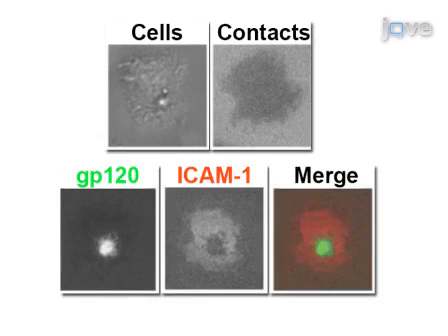This experimental approach can indicate whether cellular proteins like the lymphocyte-specific protein kinase LCK are recruited to the HIV virological synapse.